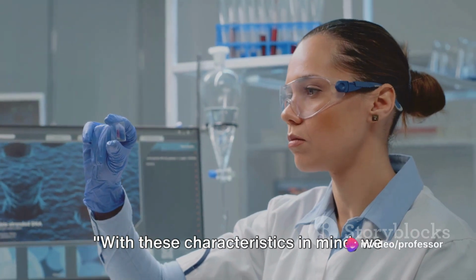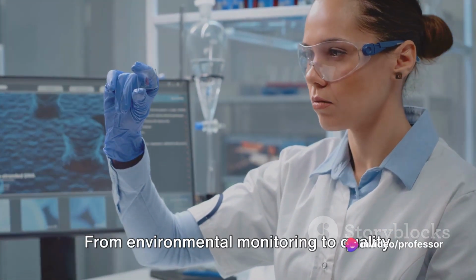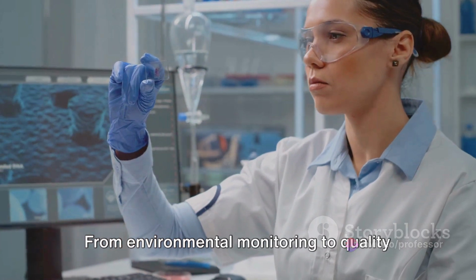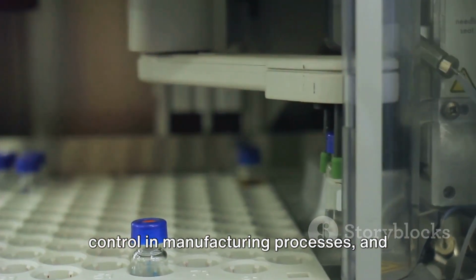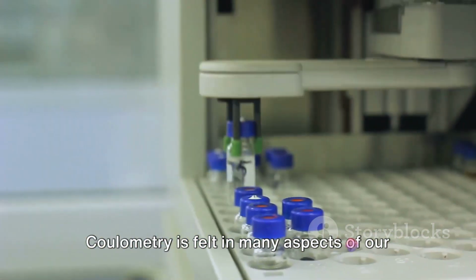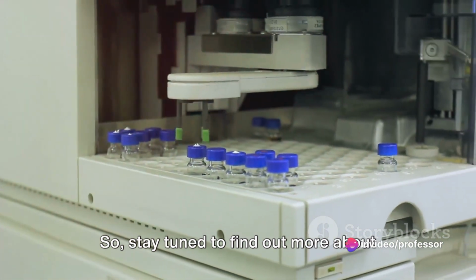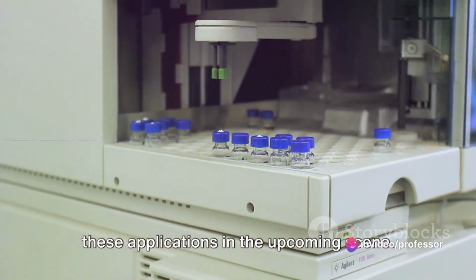With these characteristics in mind, we can appreciate the real-world applications of coulometry. From environmental monitoring to quality control in manufacturing processes, and even in medical diagnostics, the impact of coulometry is felt in many aspects of our daily lives. So, stay tuned to find out more about these applications in the upcoming scene.